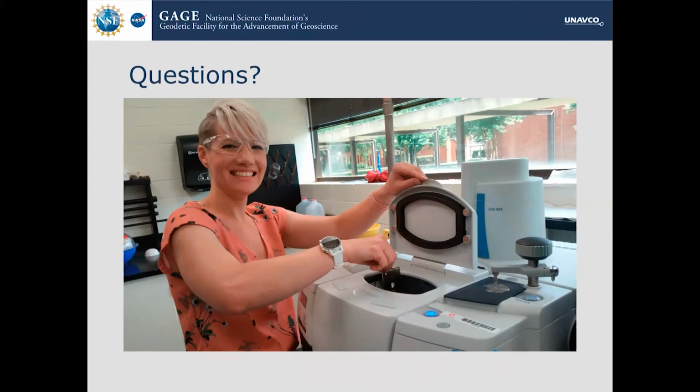So that's a very good question. Typically with IR, whenever you're homogenizing the sample, you want the smallest grain size possible. For these clay grain sizes, the best is to get it below 5 microns. So really, the smaller you get, the better. The clearer the spectra is, the less noise, and you can see the chemical bonds a lot better.